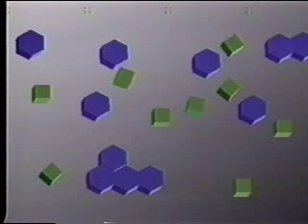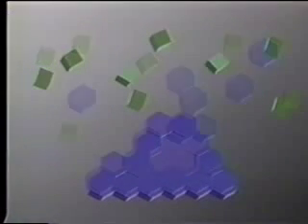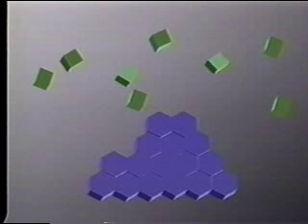If time is allowed for equilibrium between molecules in solution and molecules in a crystal to be established, only like or suitable molecules will be allowed into the growing crystal structure. If, however, crystallization proceeds too quickly, impurities can be trapped in the structure and a precipitation rather than a crystallization occurs.